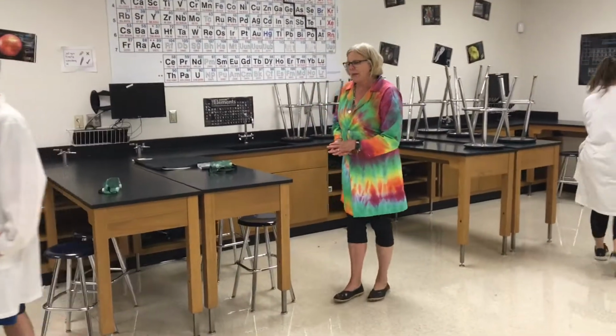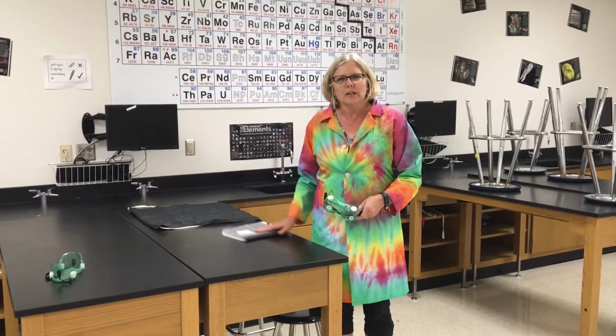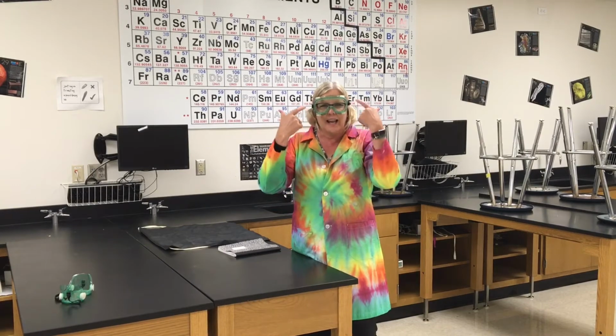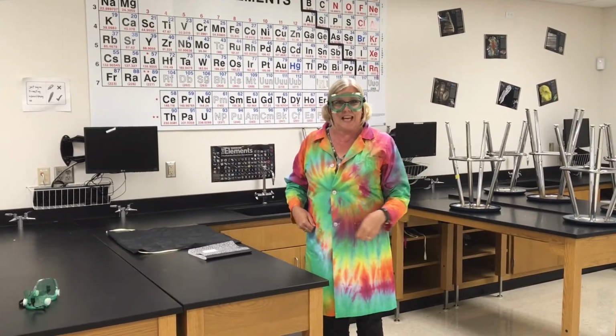Teachers. So today we're just going over a few of the safety concerns we have. First thing, if your teacher tells you to wear goggles, you are going to be wearing goggles or safety glasses, whatever, in the classroom. Now I have glasses, and even though I have glasses, they aren't the same thing. So with the goggles, especially in pre-AP, you're going to be putting them over your face, and when you're done, you have awesome smile lines by the end of the day.